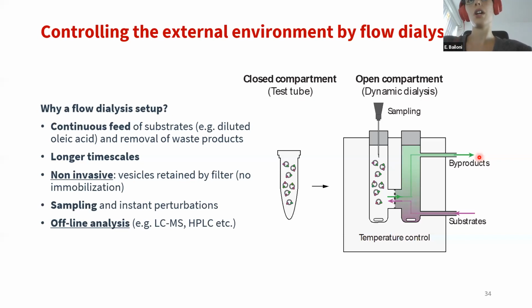Of course, we want to work over longer timescales. But really the key point for us is that the technique has to not be invasive. So we want to retain the vesicles, but also be able to collect them back for offline analysis, for example, by mass spectrometry, HPLC, and so on.